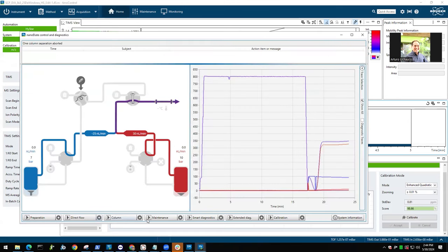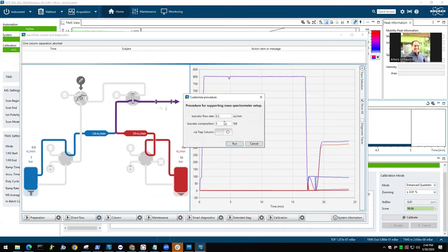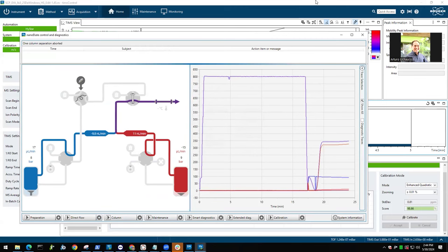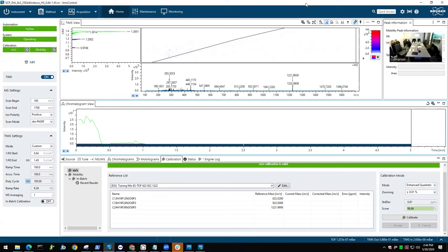I just start a bit of flow, sorry. You actually have a live view of what is flowing into the mass spec at the moment. So you have your m/z scale here, you have your ion mobility up here, and we measure in 1/K0, that's our way of expressing the collision cross section.